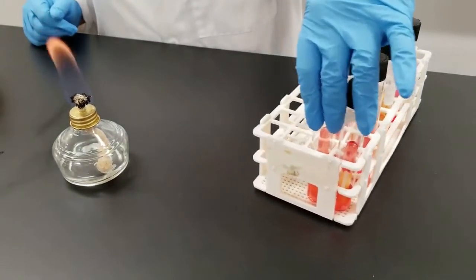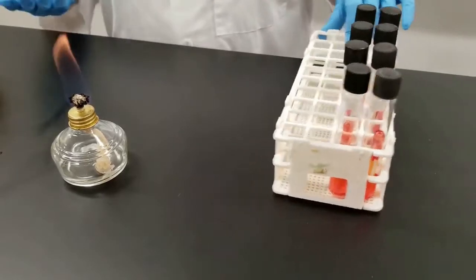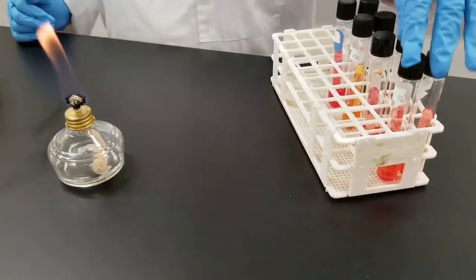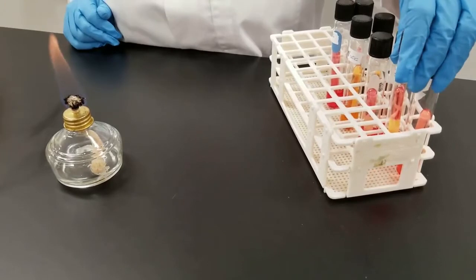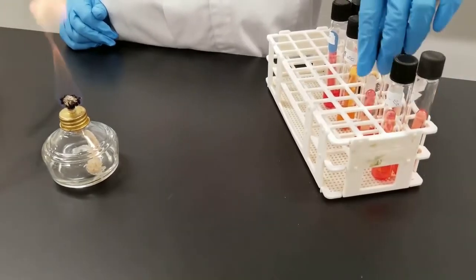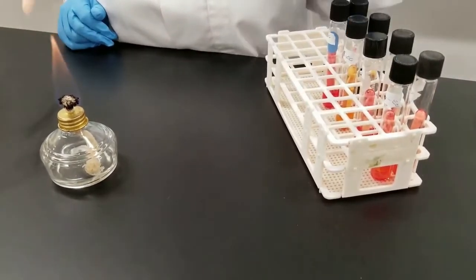So we have four different sugars. They look the same pretty much in the tube so you can't just go by looking, you need to watch your labels. We have glucose, lactose, maltose, and sucrose.